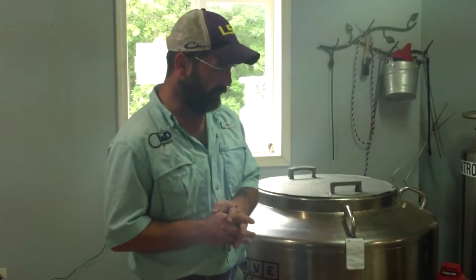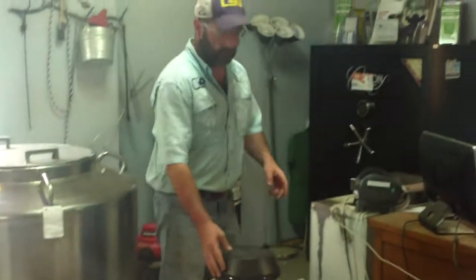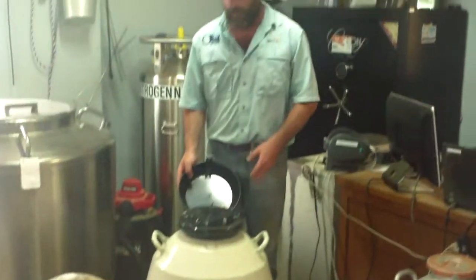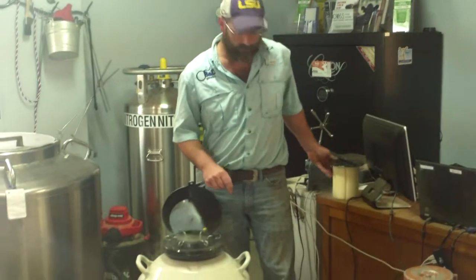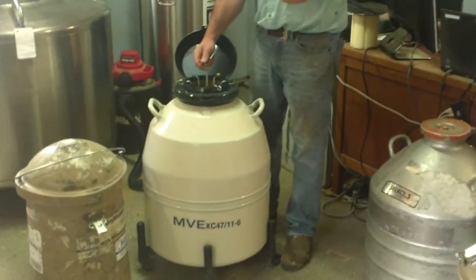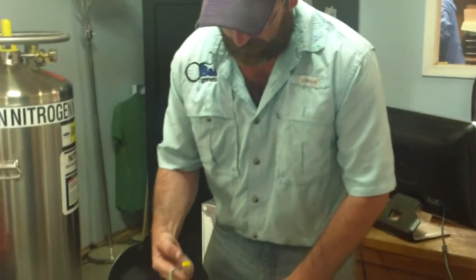Negative 196 Celsius is what we're working with. Once samples are frozen, these liquid nitrogen tanks — which you can see are round — have what's known as a canister on the inside that actually holds the samples. If you look right over here, you can see that we have a tab on top, and that's how we identify them when we're looking in the tank and trying to find something quickly.